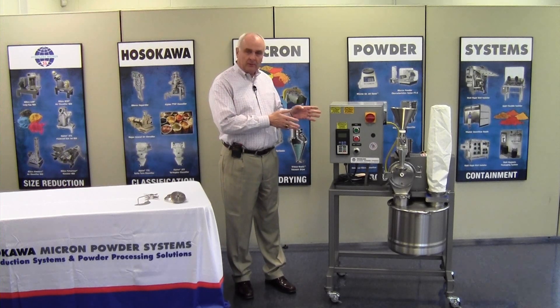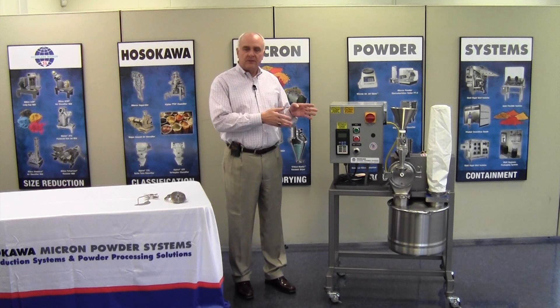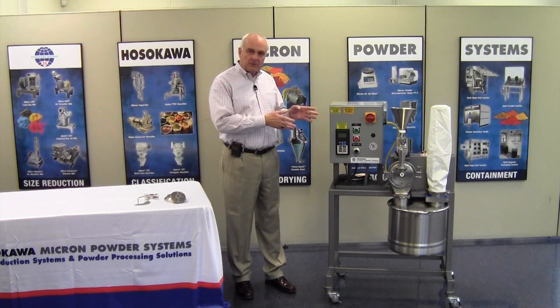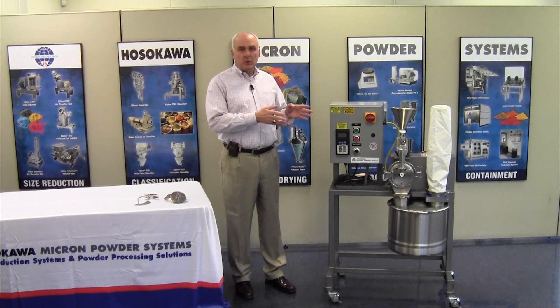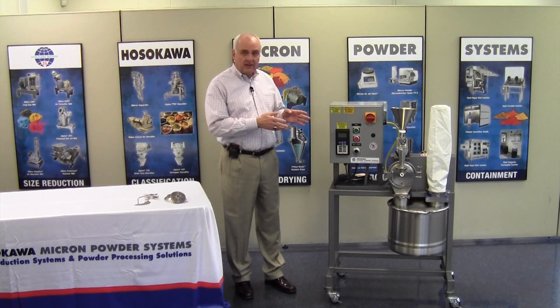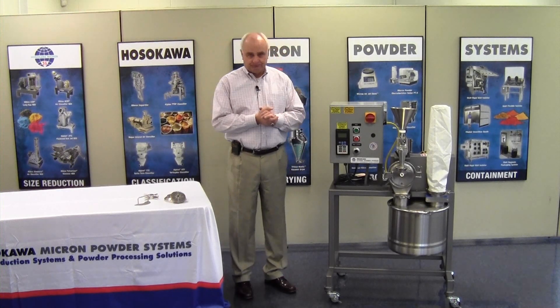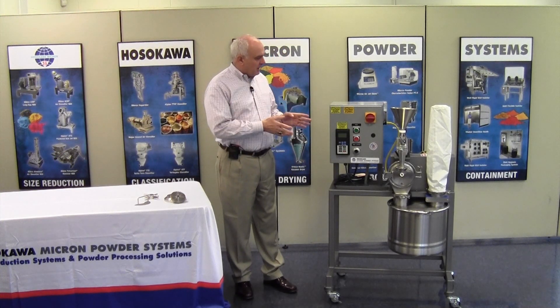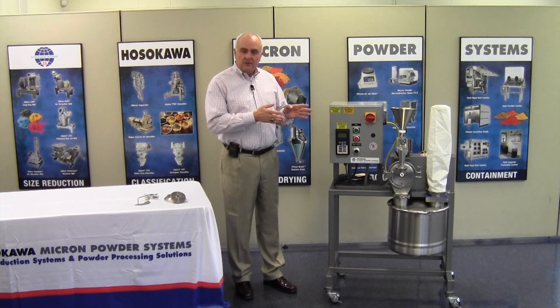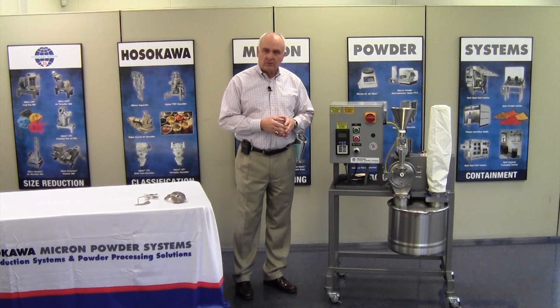Here you see a micro UMP-B, a small pilot scale unit. We have a total of five mills in this series, from a small LPM2 to the largest UMP3, which has 40 horsepower and can handle several thousand pounds an hour of capacity. The mill was designed to service all industries, but it's primarily designed to meet the requirements of the food and pharmaceutical industry.